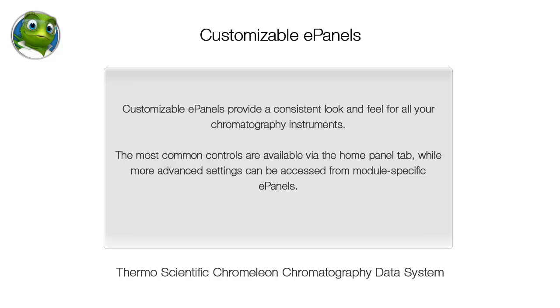Customizable ePanels provide a consistent look and feel for all your chromatography instruments. The most common controls are available via the Home Panel tab, while more advanced settings can be accessed from module-specific ePanels.